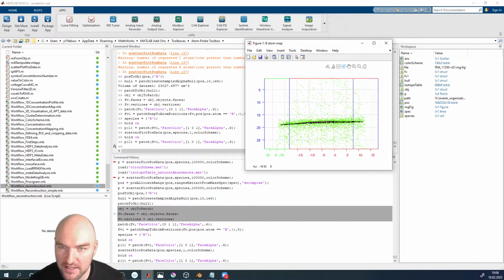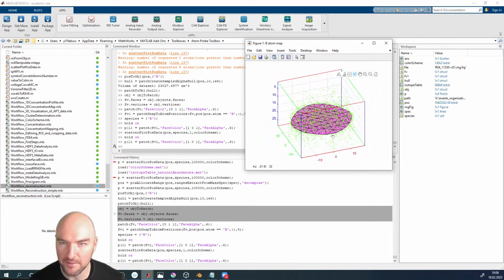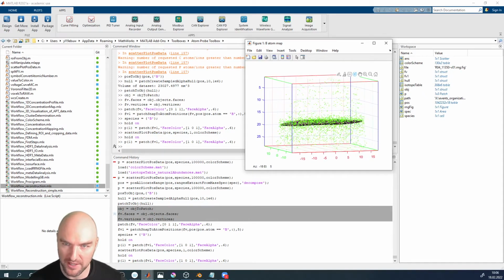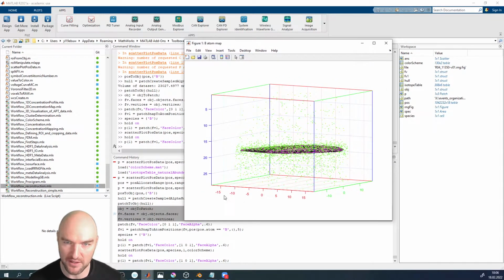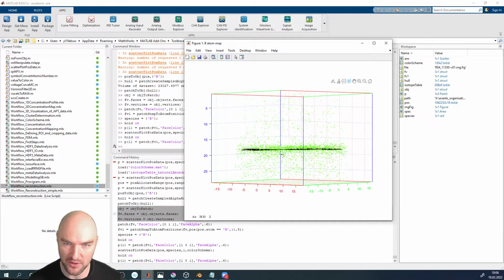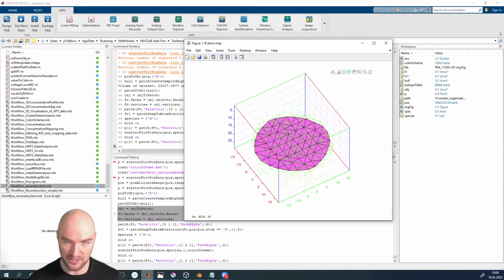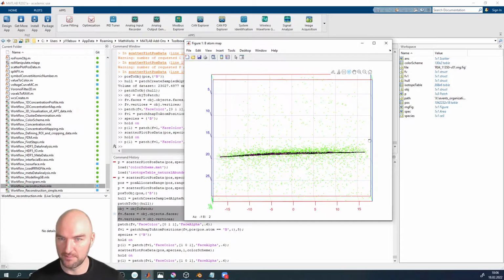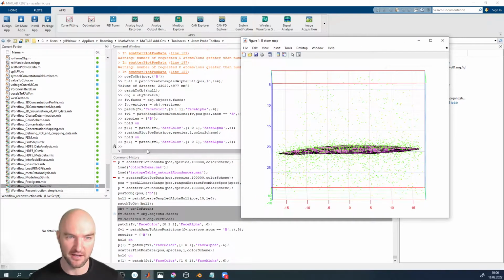And now you can see, yeah, that is already a pretty good outline of where our grain boundary is, and it's pretty close to what we had before, but it now takes the really subtle bends we have in our grain boundary into account a bit more. Of course, this is a very, very simple grain boundary, so outlining it manually wasn't actually that hard. But I think this is a pretty satisfactory result for now. Of course, we can try what happens if we do that in another iteration.